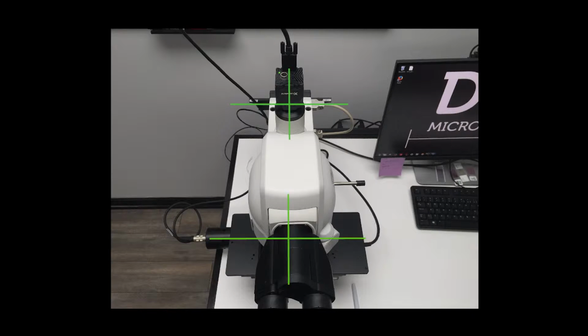We mean by camera alignment that the x-axis of both the camera and the stage are parallel. It will ensure that the movement between the acquired frames are not tilted.